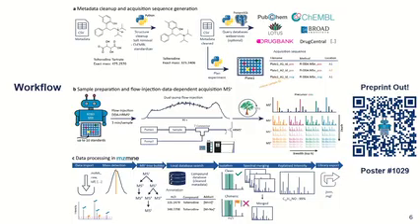And the whole pipeline looks a bit more complicated, of course, so it's not so straightforward. So we divided the whole processing basically into 3 main tasks. The first one is the metadata cleanup. I will not talk today about all the details. There's also a preprint recently published, so you can definitely check this one out, or you can also join me at my poster number 1029 if you want to know more about it.